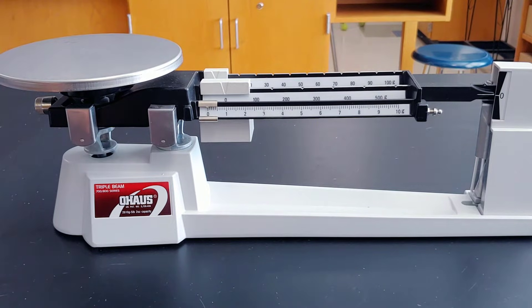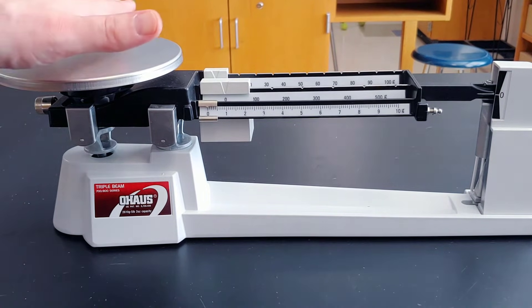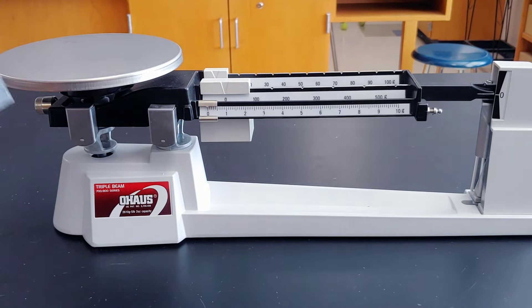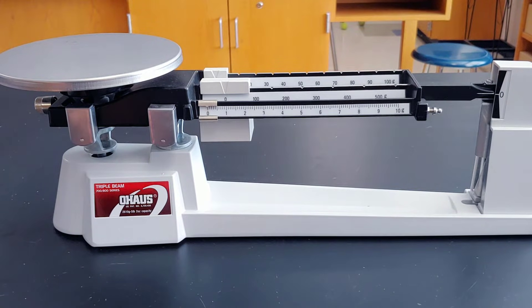First, let's review the parts. This is the pan. This is where we'll be placing our objects that we want to measure the mass of. Make sure you place it in the center of the pan for the most accurate measurements.